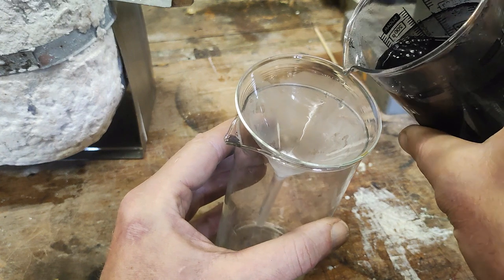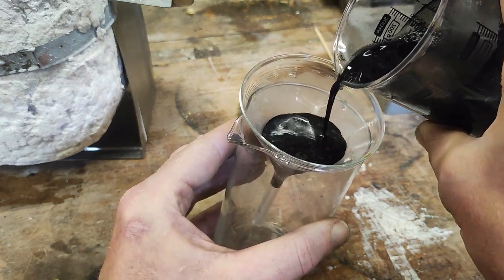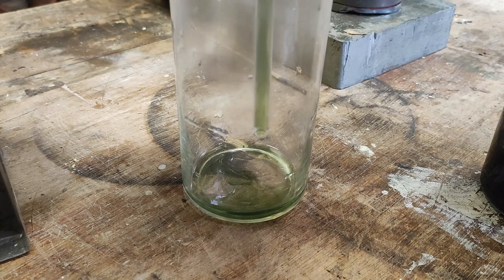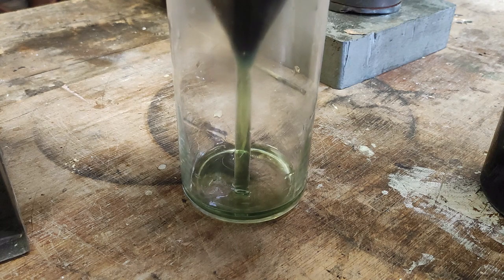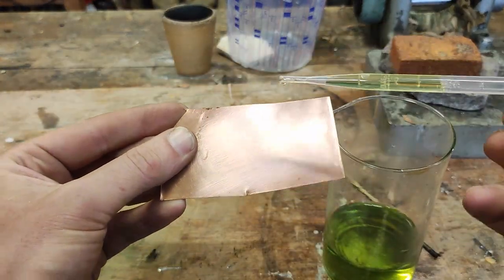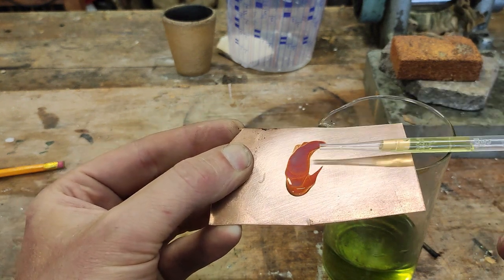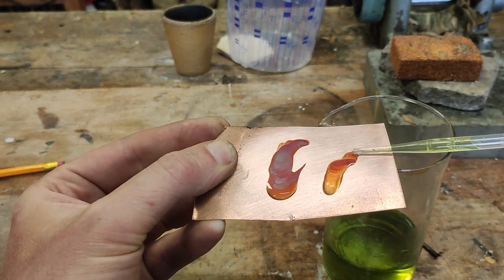It's very water soluble, so you can simply dissolve it out and filter off the remaining carbon. I did that through a little piece of cotton wool. And the remaining liquid is potassium sulphide, which reacts very quickly with clean copper.